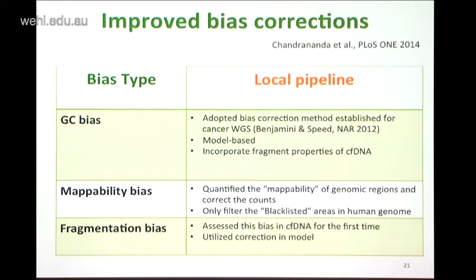But this wasn't enough, because in next-generation sequencing data, you sometimes get stacks of reads that occur because of the nature of the sequencing. These stacks of reads occur at blacklisted regions of the genome. The ENCODE project has some nice annotation that gives about 226 small regions that have huge numbers of reads.